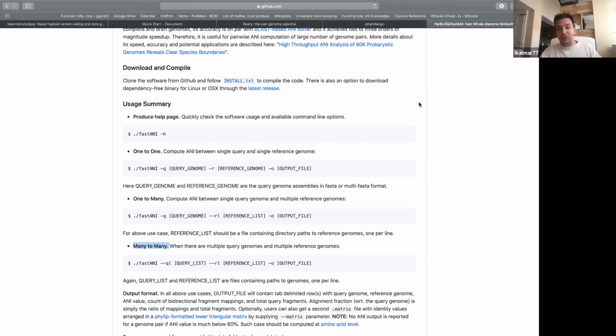And if you want to do a quick picture of your high diversity sample, like for example metagenomics sequencing, then use a k-mer-based approach where you are extracting small pieces from each genome and try to find those small pieces in the other one.